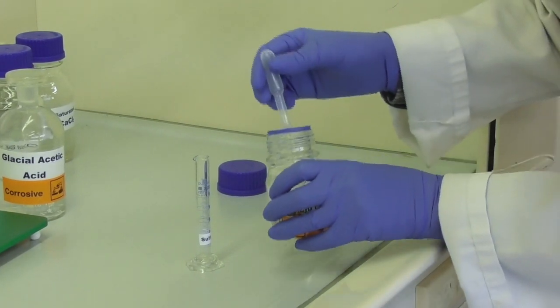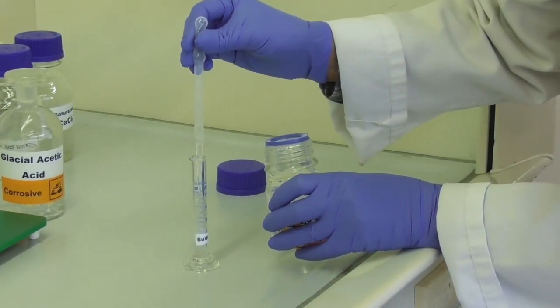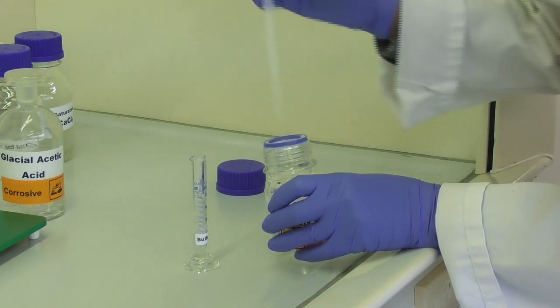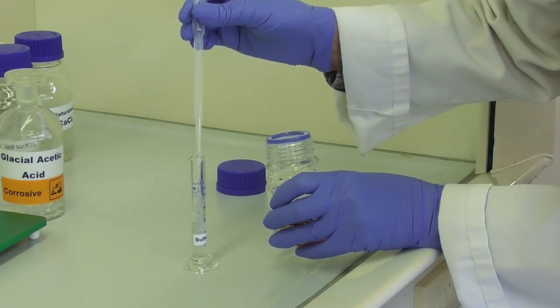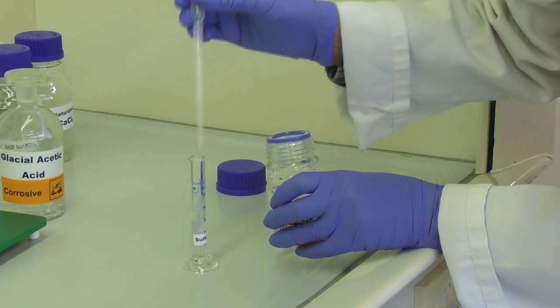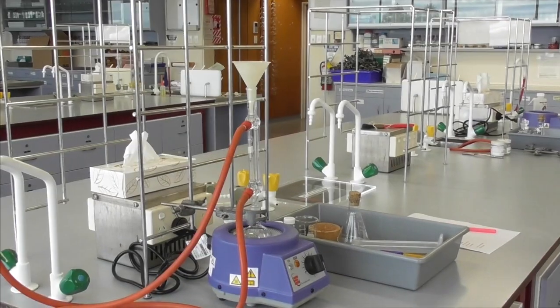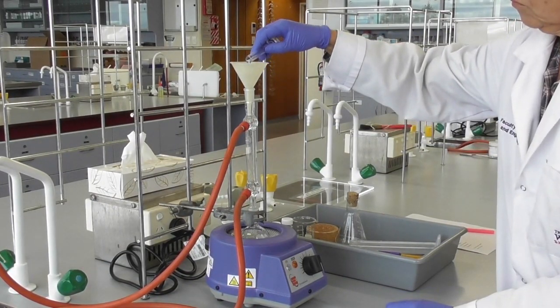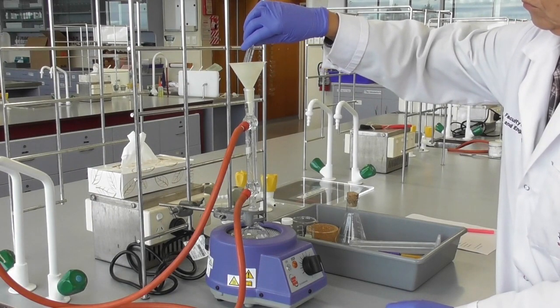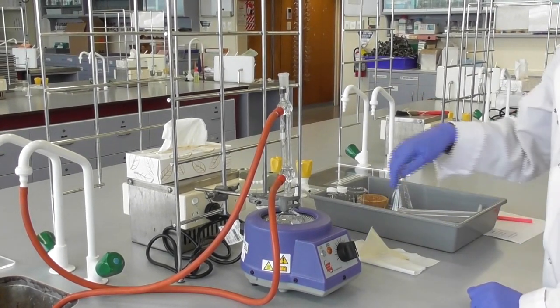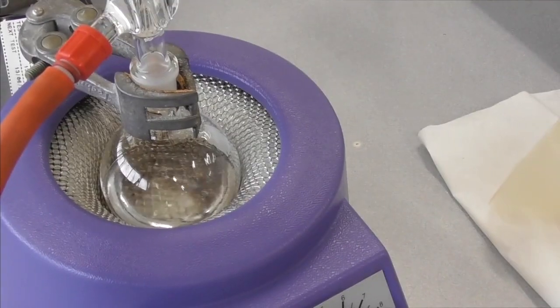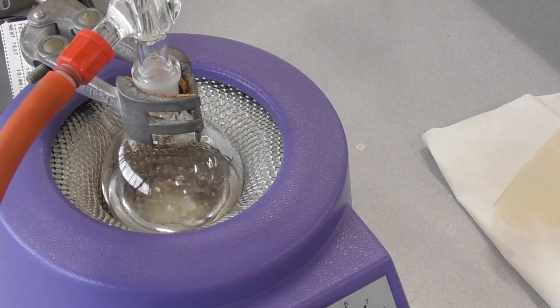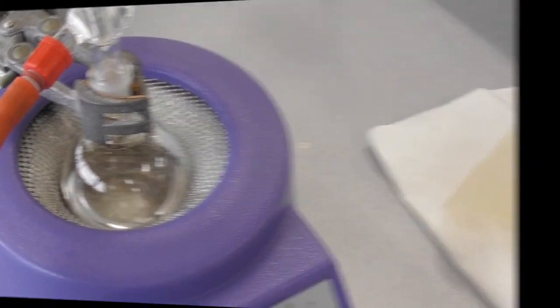The last reagent is 3ml of concentrated sulfuric acid. We measure this out with a dropper and then take it back to the bench and add it into our flask. We remove the funnel and turn on the heating mantle. We have to wait until the solution is boiling and refluxing before we start the timer.